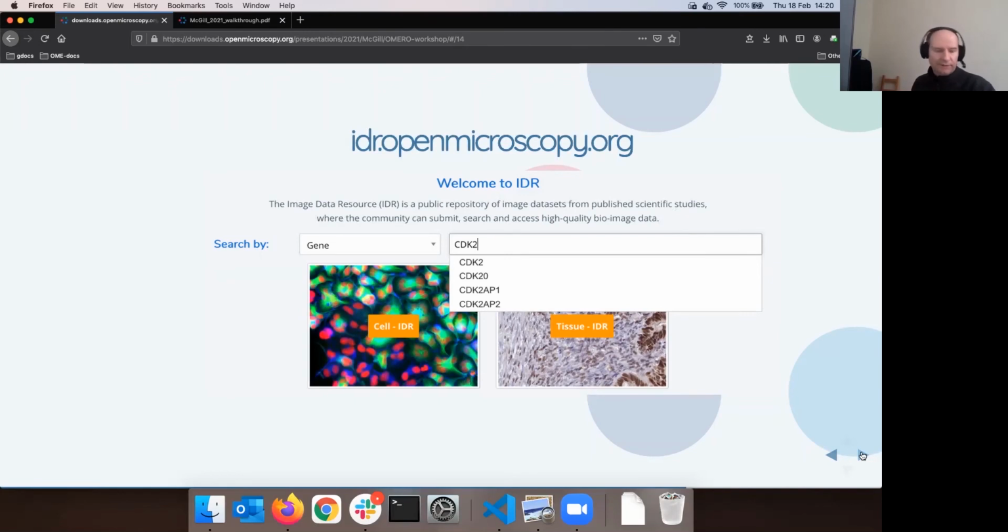This, of course, has nothing to do with whether or not you have Omero locally or whether you are using it. But why is it actually in this bracket? Well, because IDR technically is nothing else but Omero.